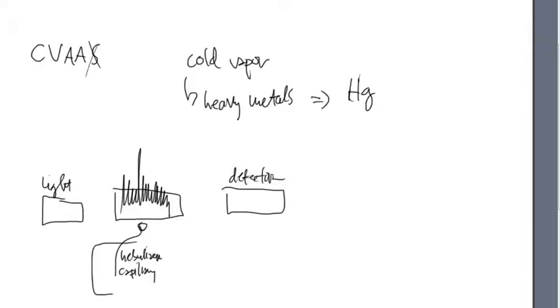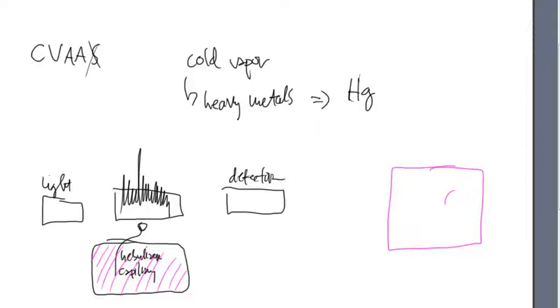It's this piece here that really is different when it concerns cold vapor AA. It's the sample compartment chamber. So, in a traditional cold vapor attachment, what you would see is a huge box that sits out in front, and this box will have some type of wheel on it or a pump, and that pump will turn over and over and over, and it's pumping two solutions through this box. And these two solutions will typically sit over here to the side of the machine, and we have to make sure that those two solutions are constantly filled. We'll talk about what these solutions are in just a second.